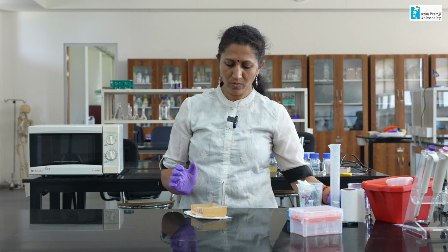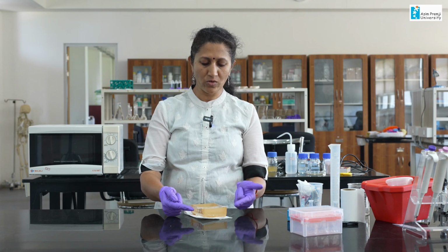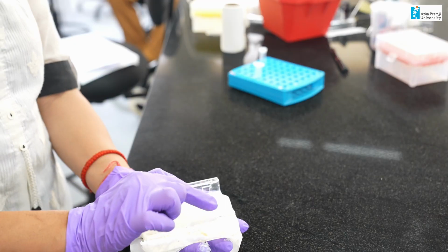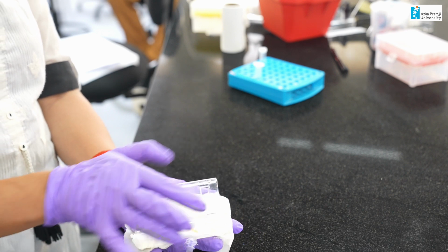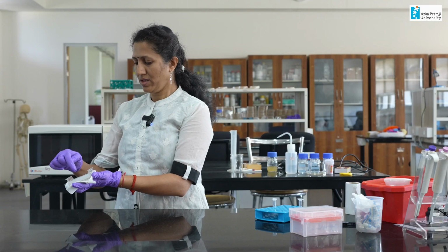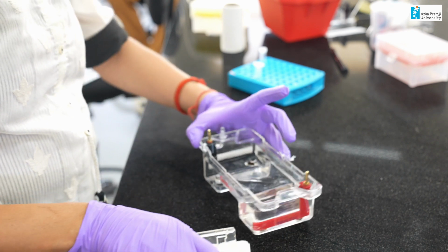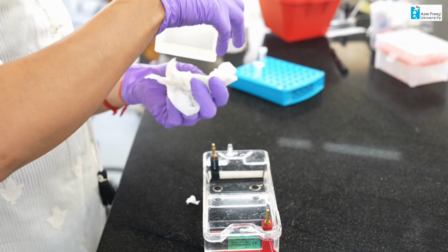Now, you just have to wait till it cools. Once it cools, carefully remove the comb, and that is the well where you are actually going to add your DNA sample. Now, the gel is cooled and you can see that I have removed the boundary that I made with the cellophane tape, and removed the comb. So, you can see the wells here. Once this is done, I am going to place it in an electrophoresis tank with 1x TAE buffer, which is already filled inside it.